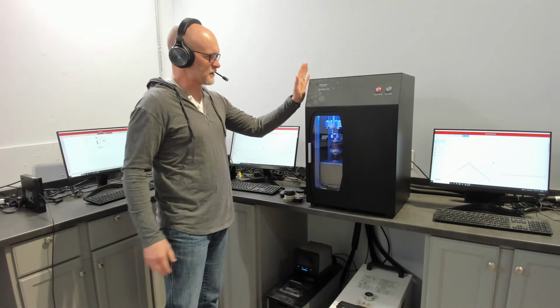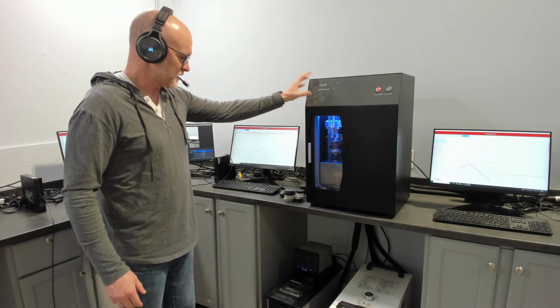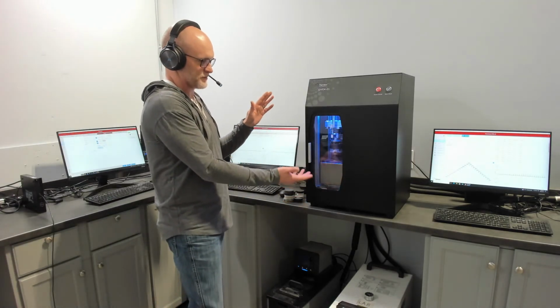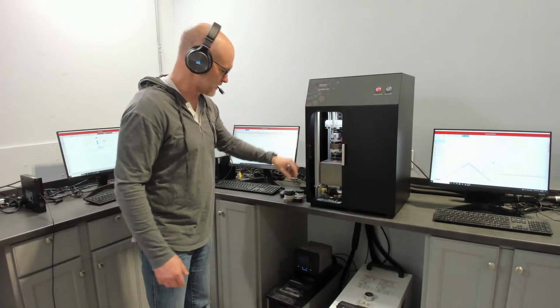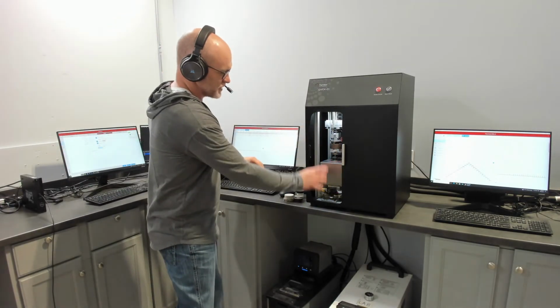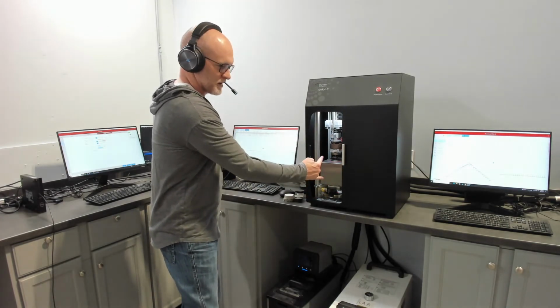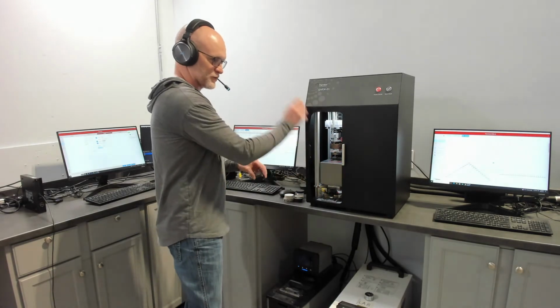So this is our GHFM01 or our guarded heat flow meter 01. It follows ASTM E1530. It has plate temperatures of -20 to 310 Celsius. It works off the principle of one-dimensional heat flow achieved by a guard wrapping around the sample, where you have very little delta of temperature laterally, so your heat is forced one-dimensionally.